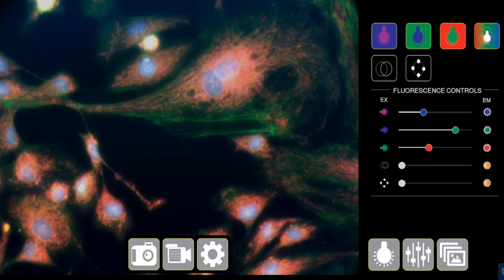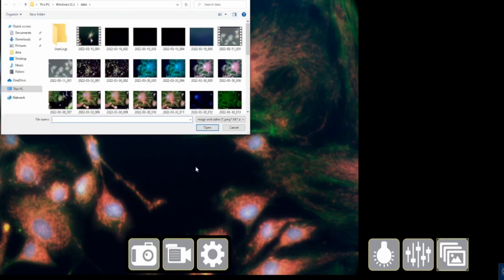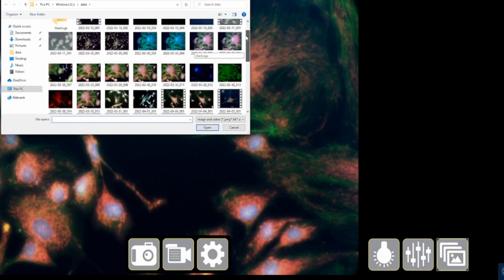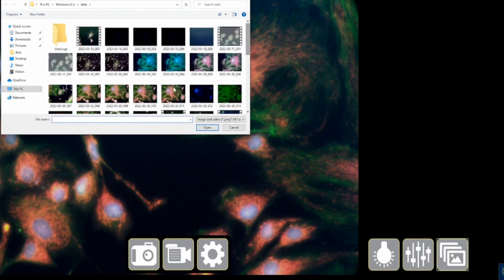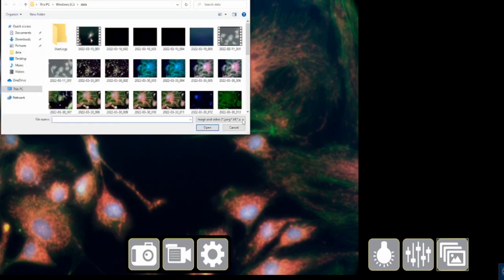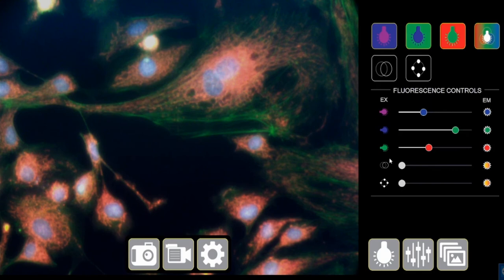This is your gallery button. It all gets stored here. You can define the location and as you can see, I have taken a lot of images and recorded the videos and they're all stored here in the gallery. And again, that's where the location is. I'll come back to my main console.